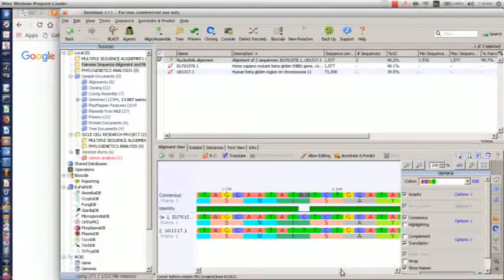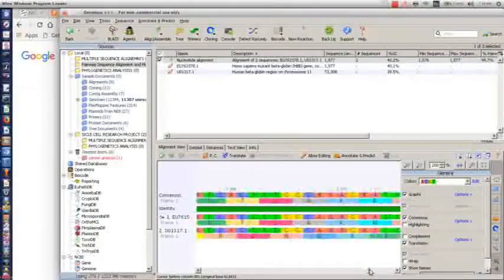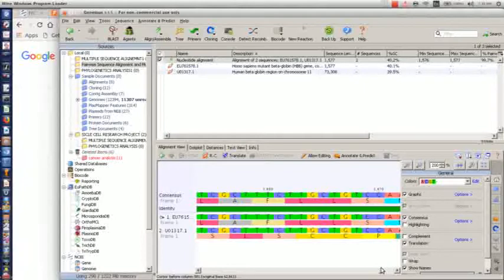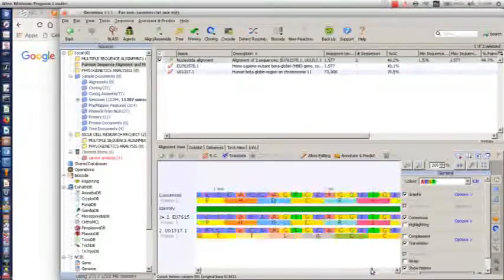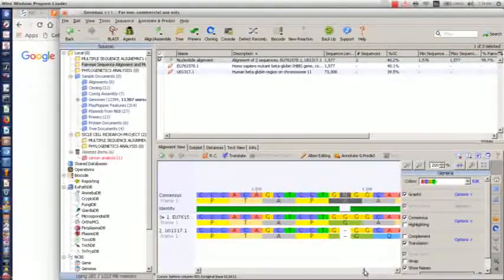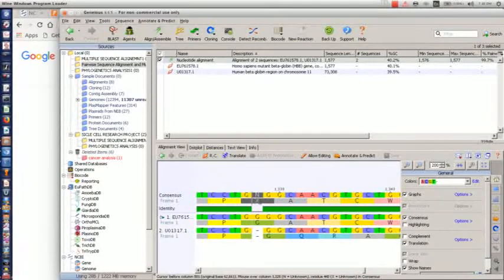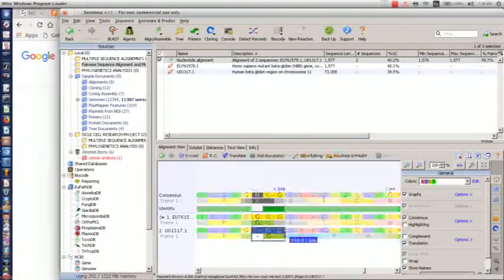So now let's go back to our deletion mutation. Now in this deletion mutation, actually there are a lot of things here. So this is X, and X symbolizes unknown. Are you getting it now? So if you look here from this gap, the codons that are supposed to form here, from here to here, are for G. And G is what? Glycine.